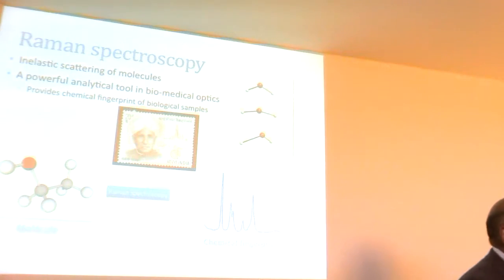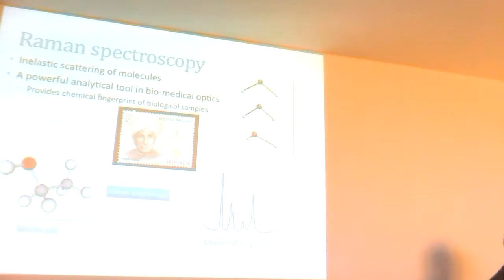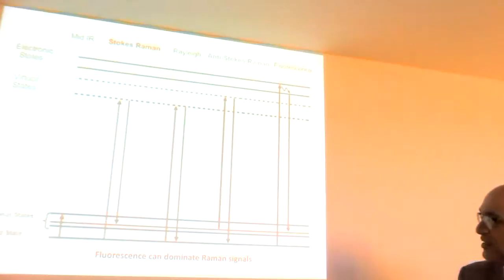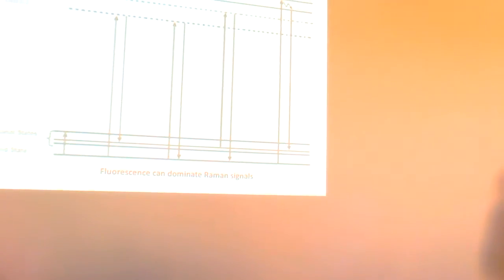Raman has survived, as many of you know. It's widely used in material science. There are companies making money. In biomedicine, it's one of these things that's always teetering on the brink, and it's teetering for a number of reasons. I won't be able to go into all the detail, but I'll show you some examples of what happens. What is Raman, rather than just looking at the scattering?